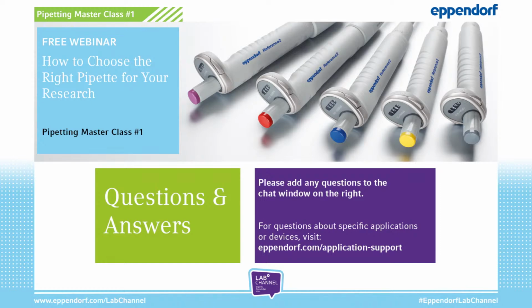As a rule of thumb, you can remember that air cushion pipettes should be used with caution with all liquids that have physical properties different to water. All right, thanks.